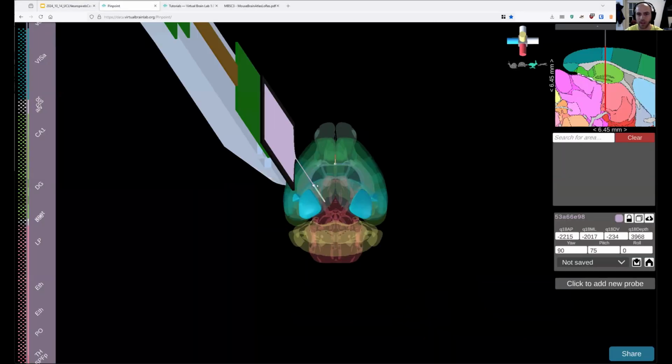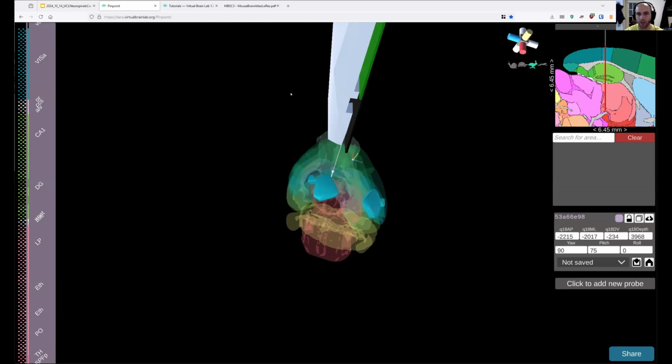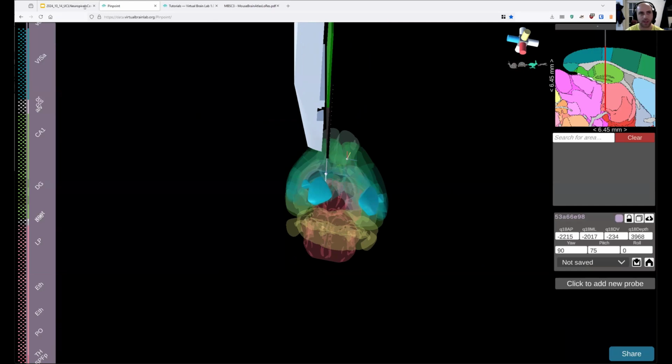And I showed you that in the demo, right? This is the reference coordinate at bregma. The corner of the CCF is sort of off over here. And then we change the axis directions so that they sort of match your intuition better. So just be aware of the directions of the axes and where the 000 point is. The little lines here are telling you which direction the axes are pointing, the positive direction for each axis.